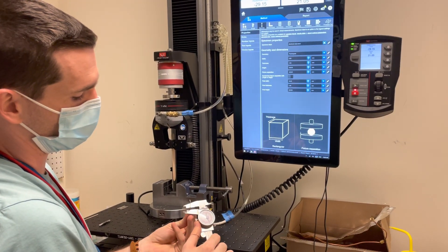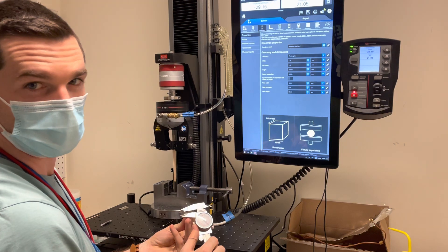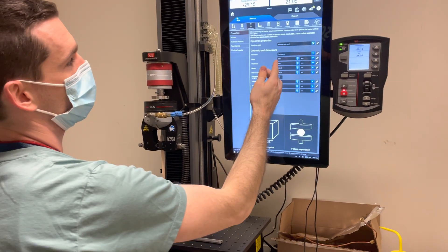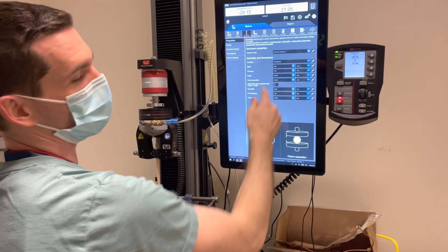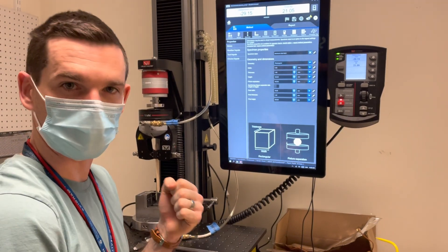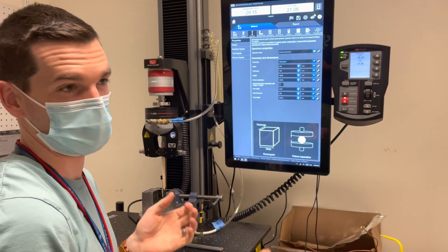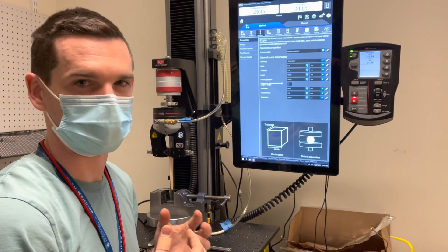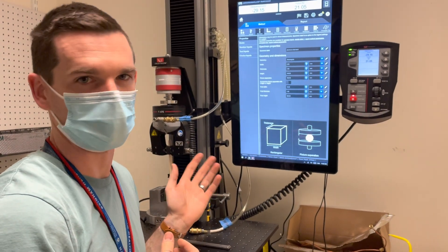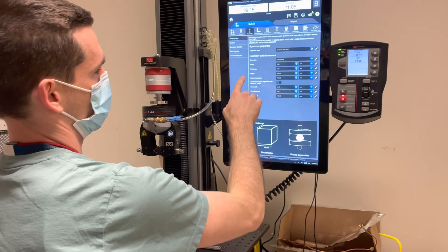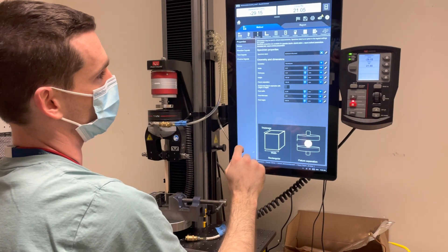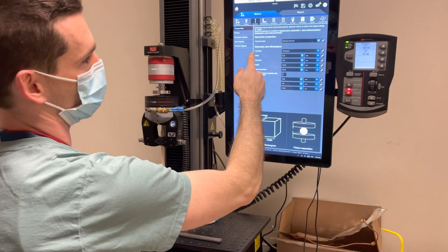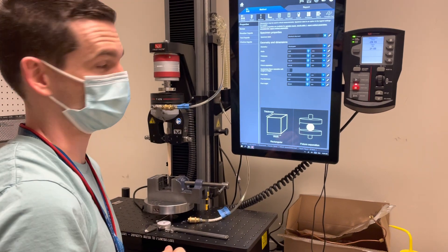This one is about one millimeter by five millimeters, and I can import those dimensions here. Basically, you consider what is the area that's being deformed or stretched in my sample. You want to take the cross-section of that, and that's used to calculate stress from the load data. So the width of my sample is five millimeters, the thickness is one millimeter, and the cross-section is a rectangular cross-section.